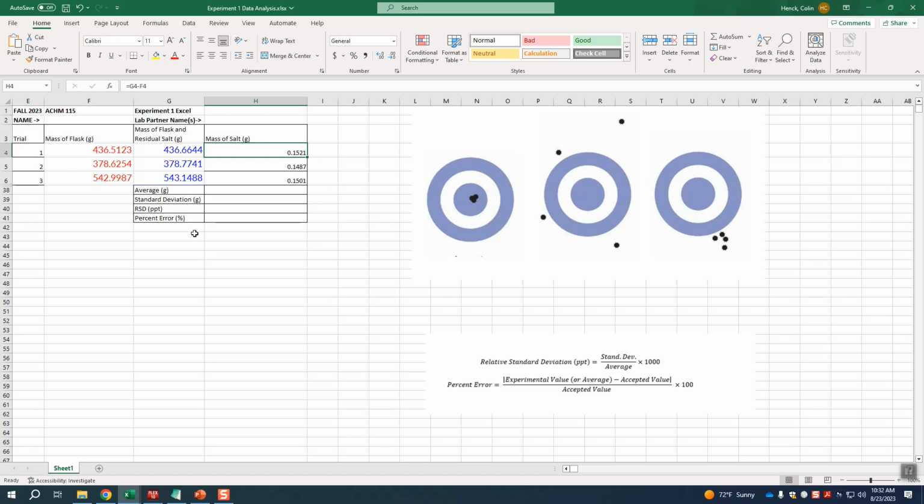When you're doing scientific work with instruments, it's not uncommon to have 1,000 data points. If you have 1,000 data points, you are not going to manipulate them by hand. Nobody's doing that because it would take you so long to do 1,000 subtractions, and you can just type it in once and drag it down if you're doing it with Excel.